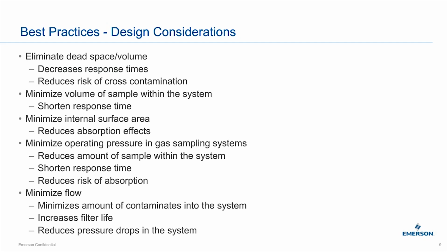Minimize the volume of the sample within the system. So it's, again, a very similar concept.